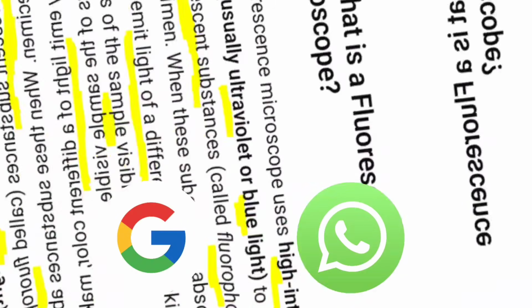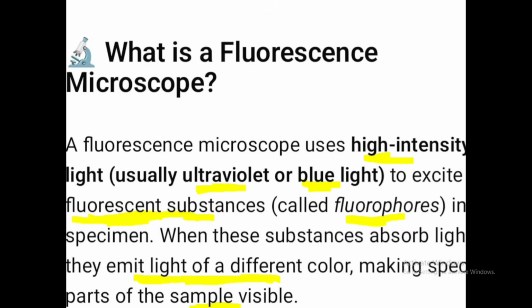Now in this video we will see the definition and parts of the fluorescence microscope, the working principle, as well as some advantages of this microscope. First, let us see the definition of the fluorescence microscope.